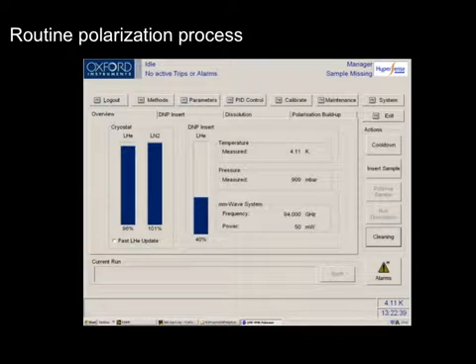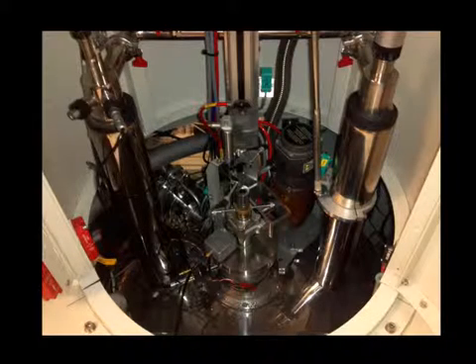But basically, you're going to press the cool down button, and you're going to watch this temperature drop, this pressure drop, and this liquid helium level rise. Eventually, it should drop to around 1.3 Kelvin. And the typical setting is to let this liquid helium rise to about 65%. Okay, so if you open the door of the Hypersense and look inside, which you've probably done the past couple weeks, this is roughly what it looks like.